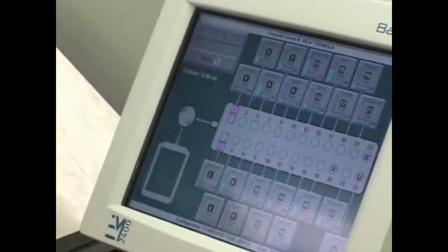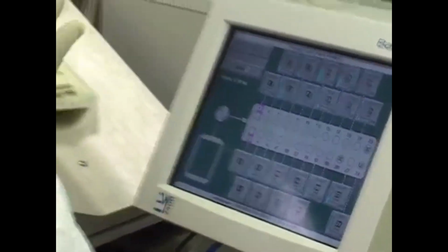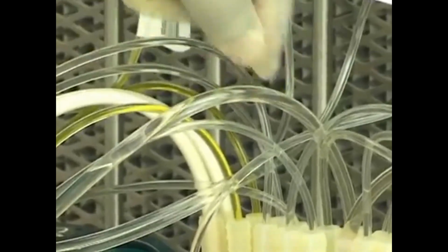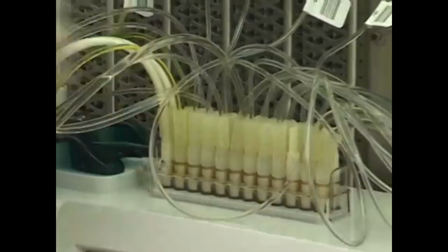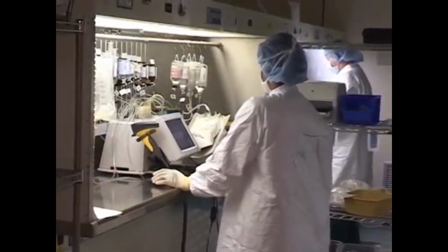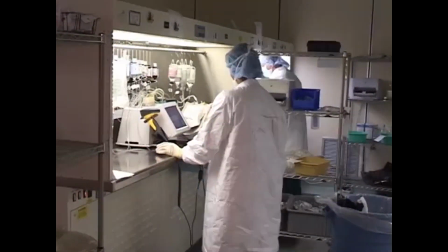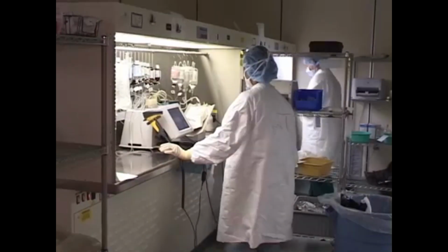The base ACD can be used with a computer or used alone. When the base ACD is used alone, you enter the desired volume and specific gravity of the base solution components, and the device weighs the correct amounts. The additives ACD also uses special tubing that delivers exact amounts of the solutions in very small quantities. It weighs the solutions to ensure proper volumes and flushes the line between injections to avoid incompatibility problems. The additives ACD must be used with a computer.